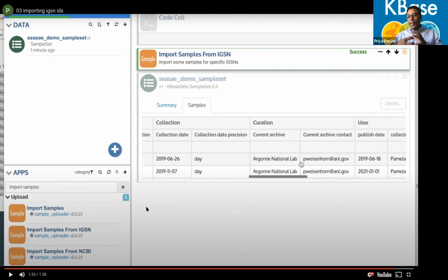So it's a really complicated problem to support such a thing, where you have data from different repositories, different users, different sciences come into the system, and you try to build a data model that can take care of all of those scenarios, given that a bench biologist might upload it, a bioinformatician might upload it, different kinds of samples could be uploaded. So it's a pretty challenging problem. How do you build such a system?